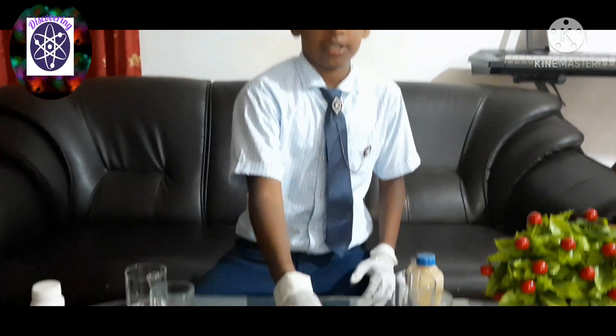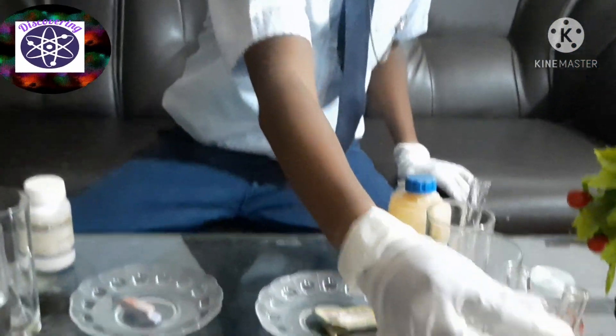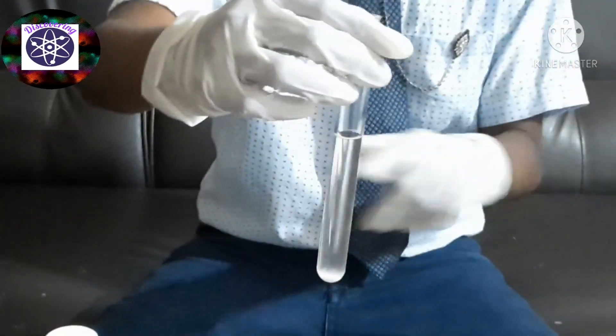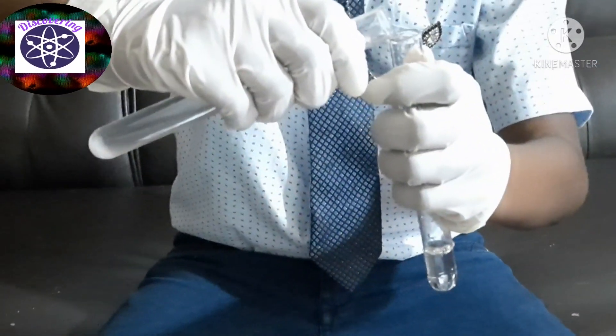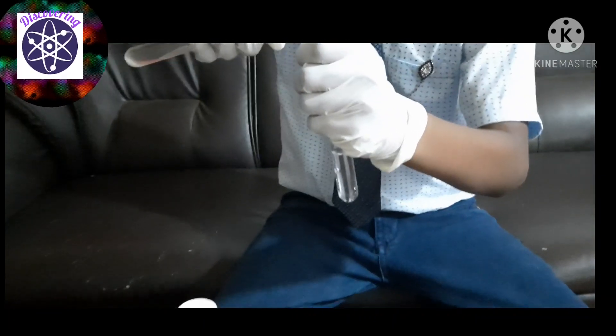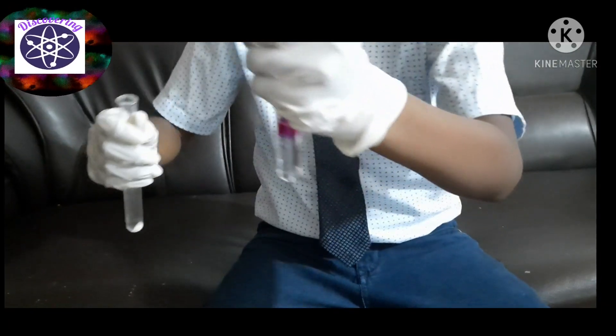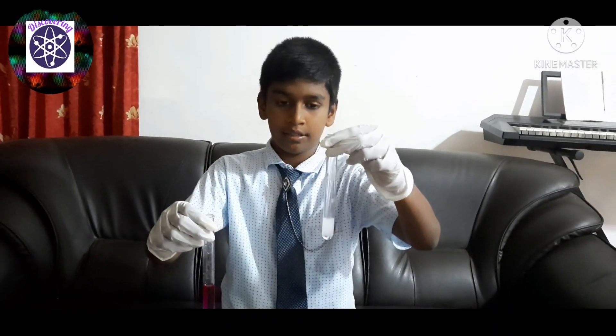Let's start with phenolphthalein. I have selected potassium hydroxide and hydrochloric acid. Now I am going to add the phenolphthalein into both test tubes. The base turned into pink and there is no color change with the acid.